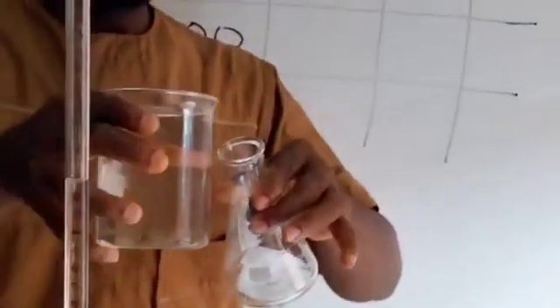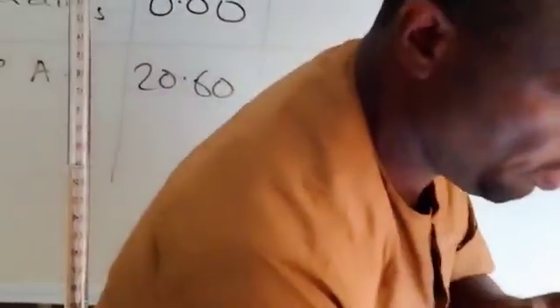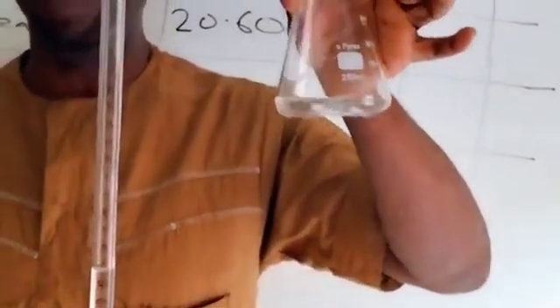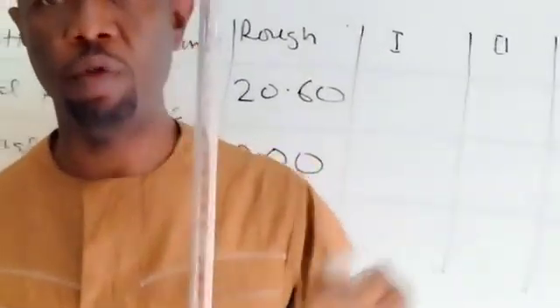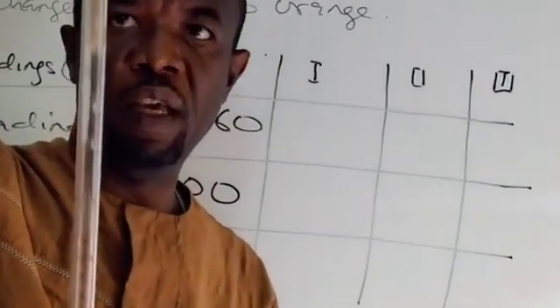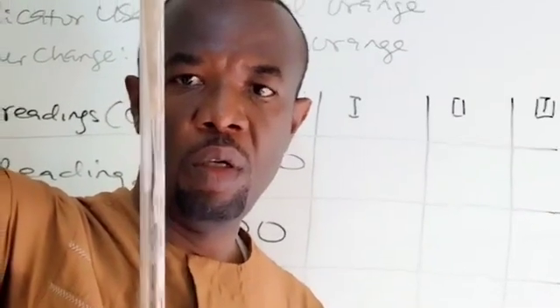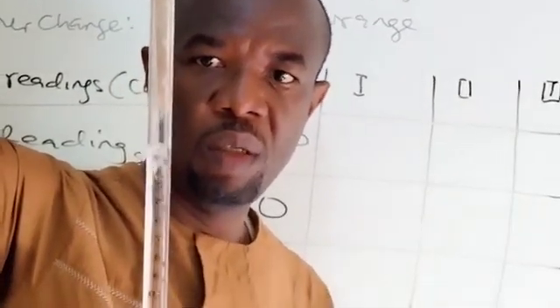So after you empty the titration mixture, you rinse it with water, distilled water only. As I say, rinse the conical flask with distilled water only, because distilled water has pH of 7. That will not affect your endpoint. Rinse it and then you pour it off. So we are topping more of A into the burette. We're adding more of A into the burette.